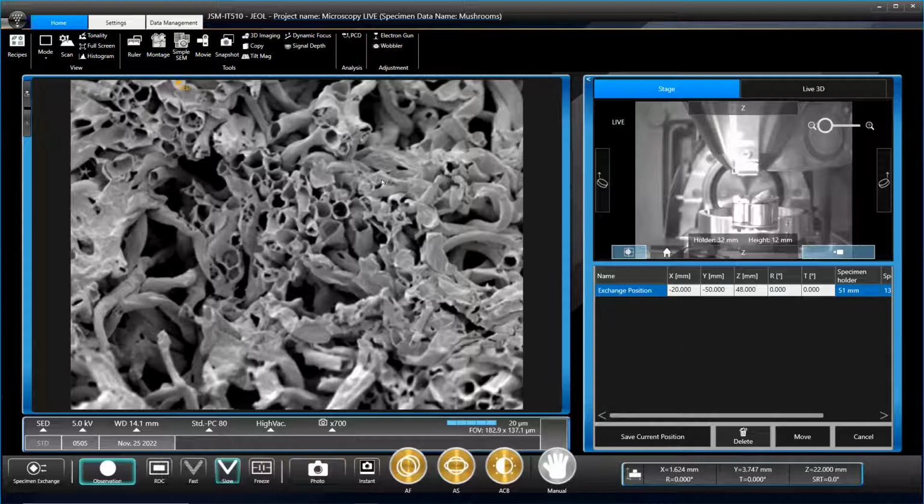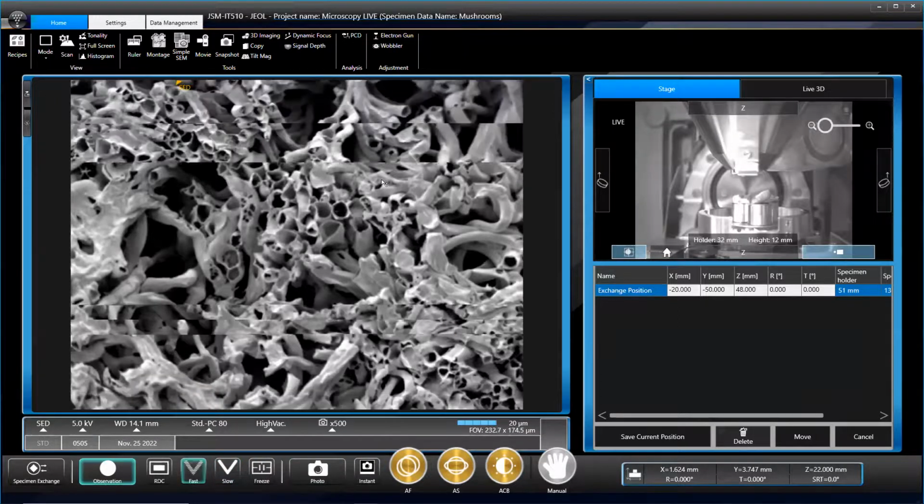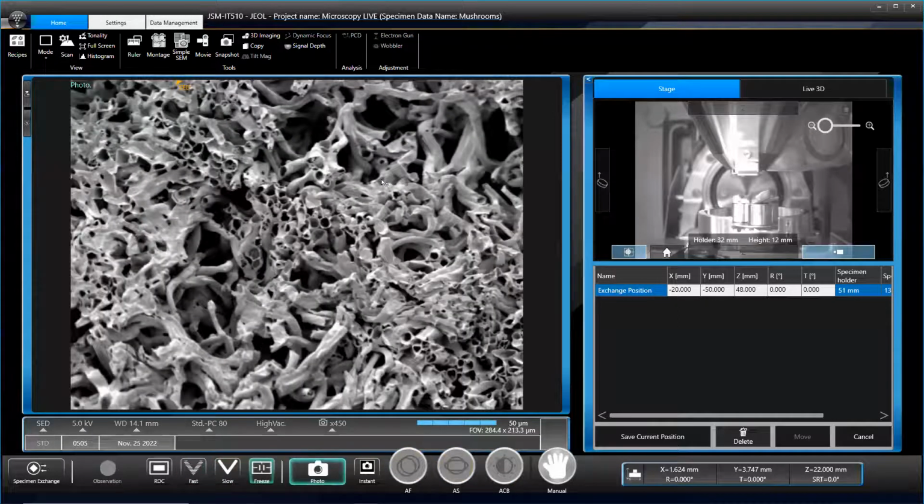So they are similar to plants in having cell walls, but they can't produce their own energy. They're more like us in that they get their energy externally. But they don't feed. They get their energy by producing enzymes. The hyphae produce enzymes that degrade organic matter, and then they absorb that and use it as an energy source.